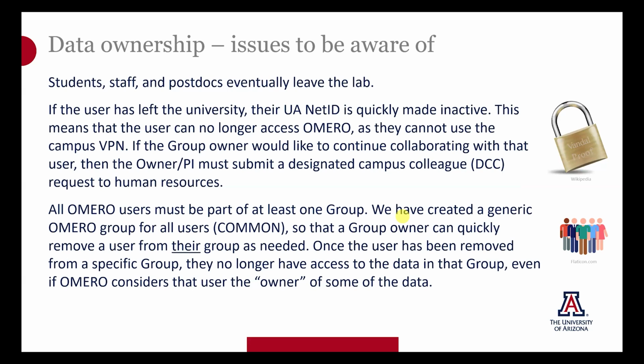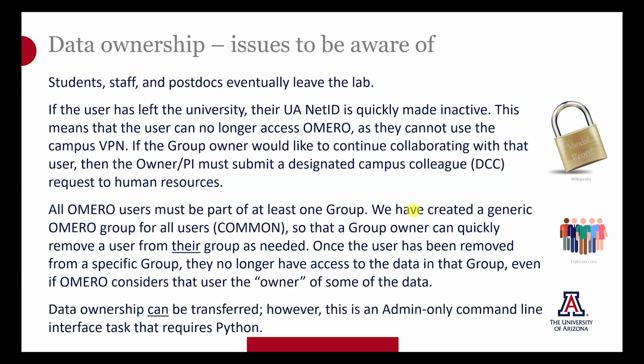If you remove someone from your group, that former group member will no longer have access to any of the data in your group, even if they're technically the owner of some of that data. As was mentioned before, data ownership can be transferred. It's just not very straightforward.